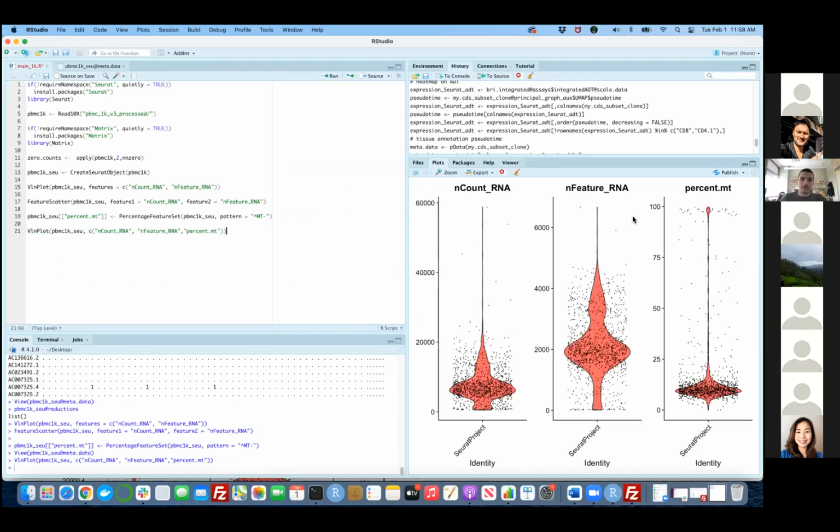It's really interesting now that you should see some cells, even though they may not have many UMIs, most of those UMIs are actually coming from mtDNA, right? So, I mean, yes, they are apoptotic cells, they are dying, but they do not have any purpose in our analysis when we're trying to find out the phenotypes of T cells, maybe natural killer cells, right?